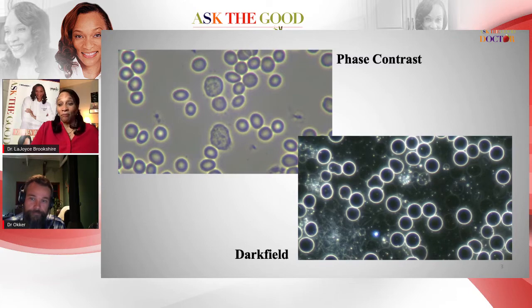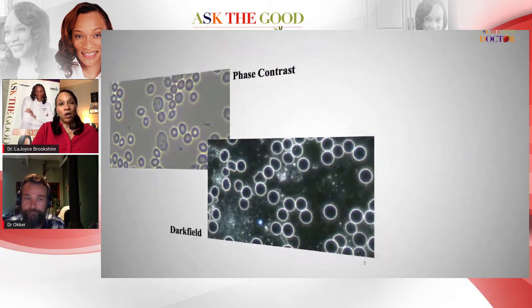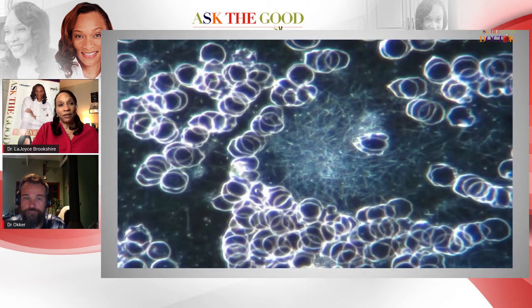Next slide, Chris. And this also could be used to determine oxidative stress. Oh, this person's in trouble. Yes, absolutely. So the red blood cells, we're quite fortunate in that we are looking at blood. Most of the cells that we'll see would be red blood cells. They're the most numerous of all the blood cells that we encounter, and the red blood cells, as part of their function to help them carry around oxygen and exchange gases, lose some of their normal cellular elements that you usually would find with other cells, which then basically prevents them from being able to repair themselves.